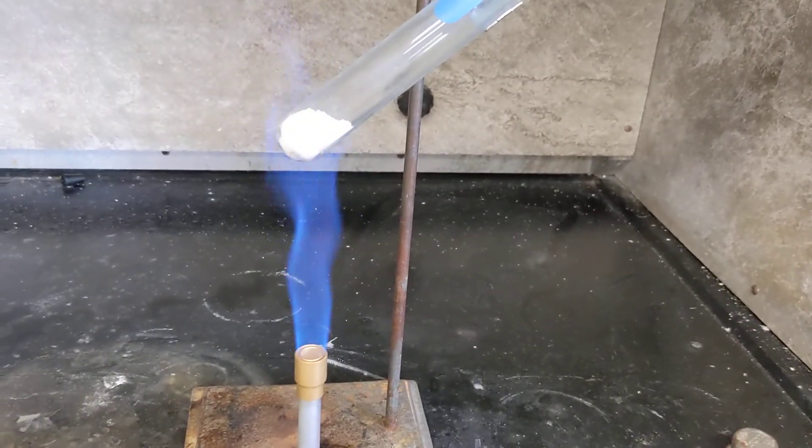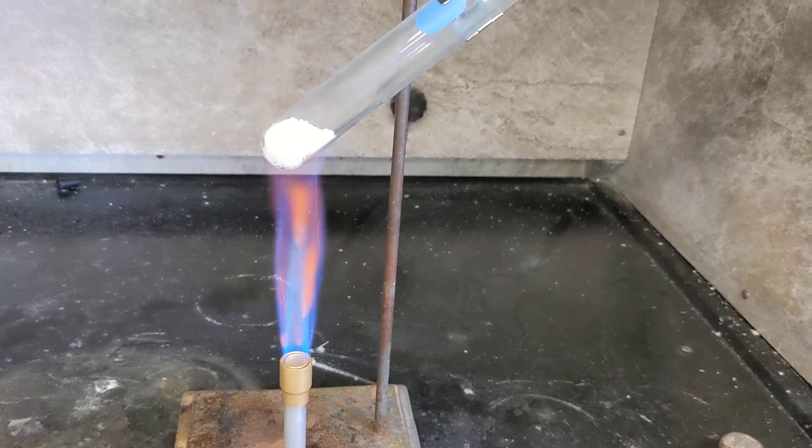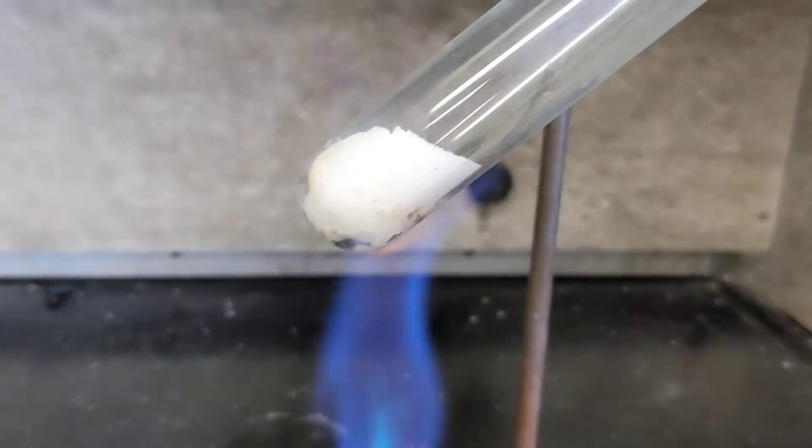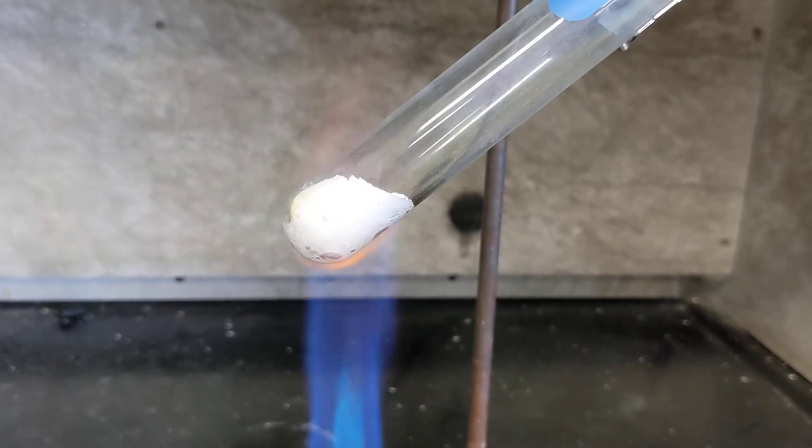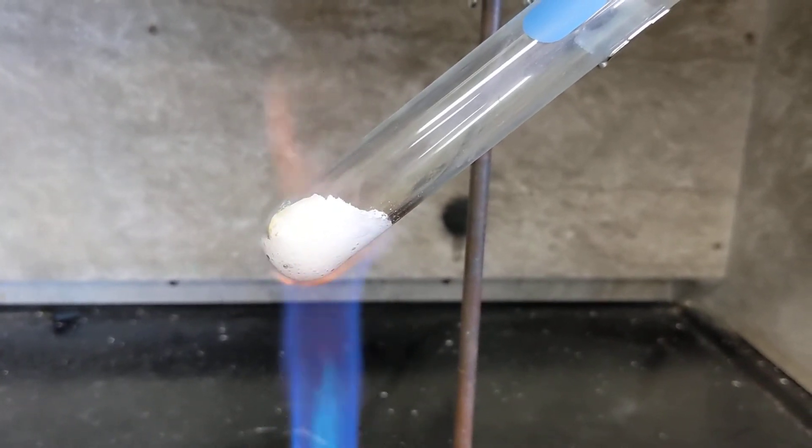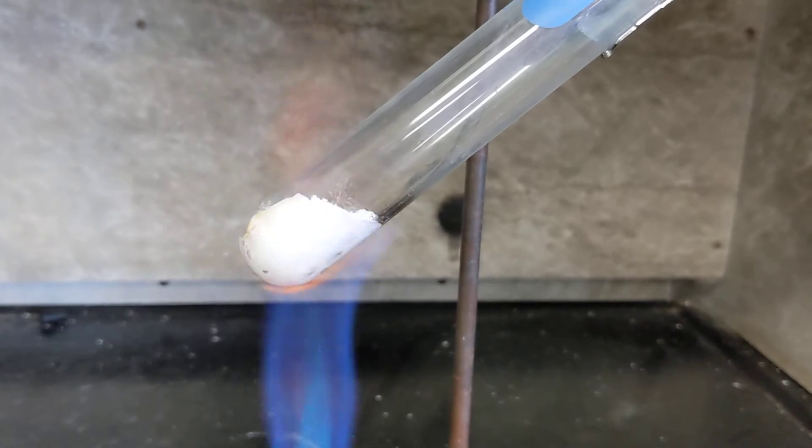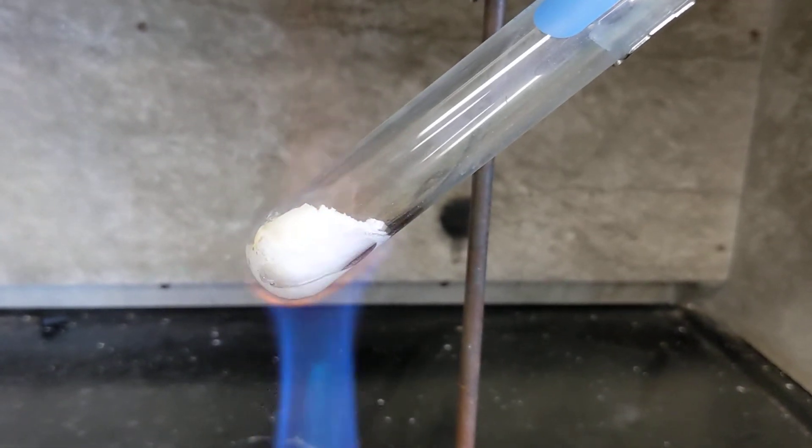So heat this up a little bit. You can see this starting to melt. So potassium chlorate contains a high mass percent of oxygen. So creating a lot of oxygen gas right now. Some of the bubbling that you see.